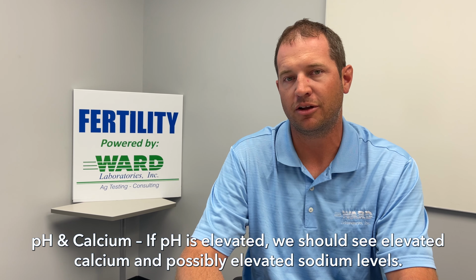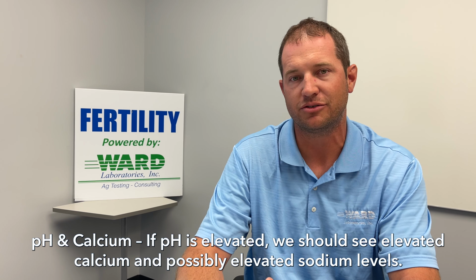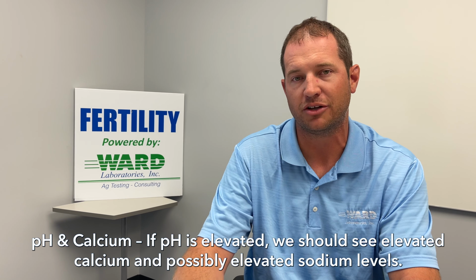And that's our final QA/QC procedure before the results are uploaded. So what kind of things would we be looking at in that final step? Well, say we look at pH and calcium. If we have elevated pH, we should see elevated calcium in those high pH areas, or possibly even elevated sodium levels.